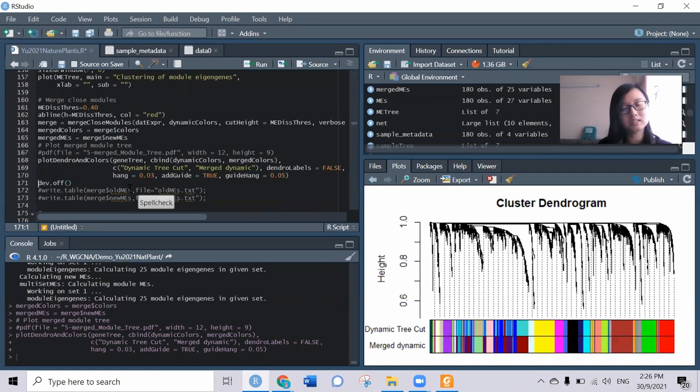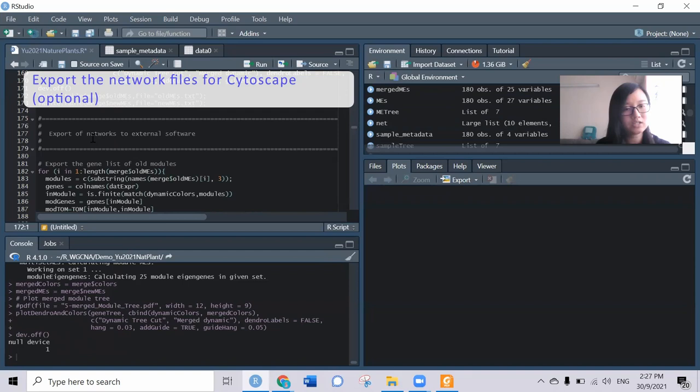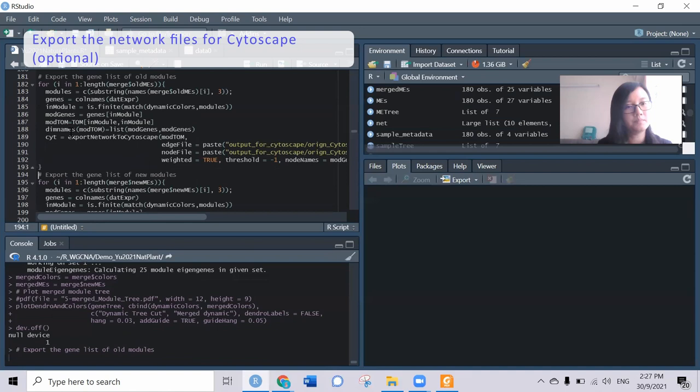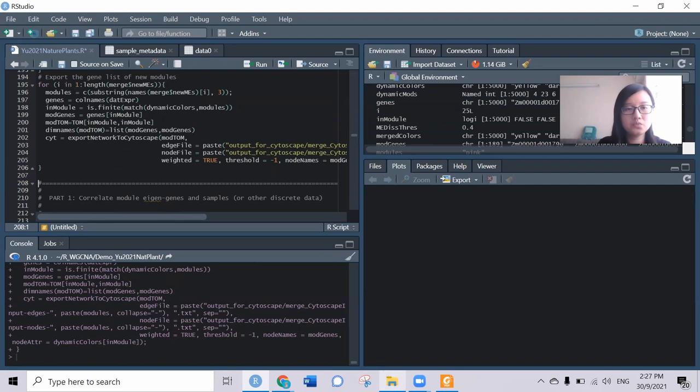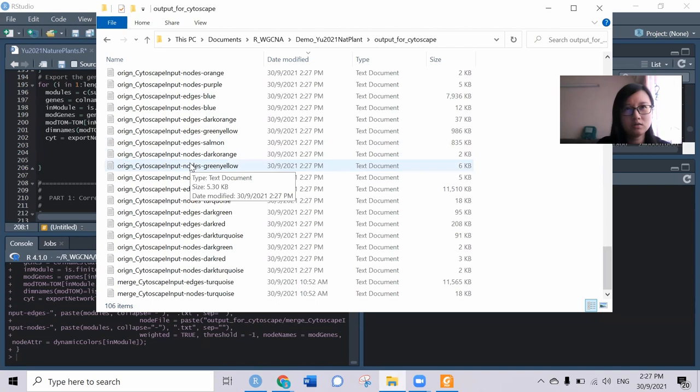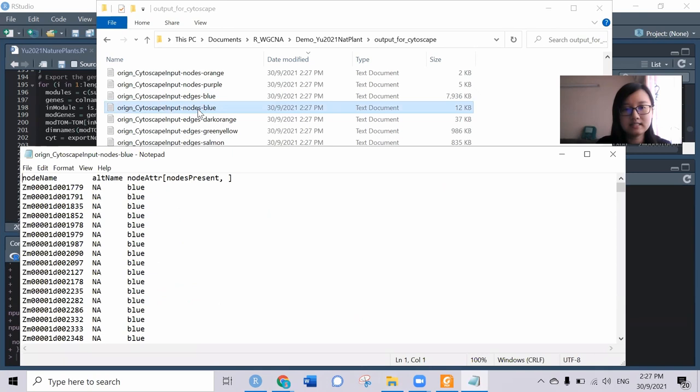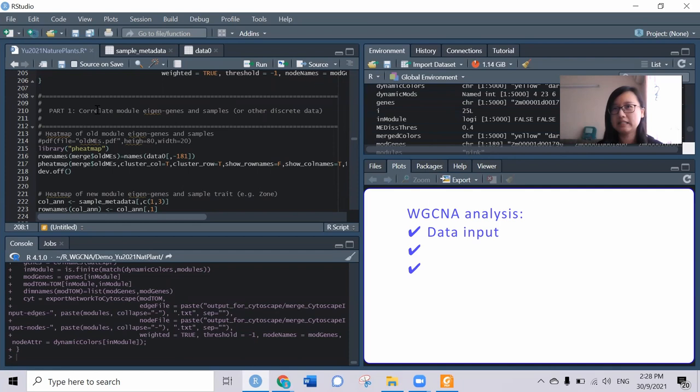Next, we can try to export the network to external software like Cytoscape. We can export the old modules and also the new modules - it depends what you prefer. You will get it from the output for Cytoscape. I've already exported all the networks into the edge and node files, very nicely done using the function. At the moment, we've completed the network construction and module assignment.